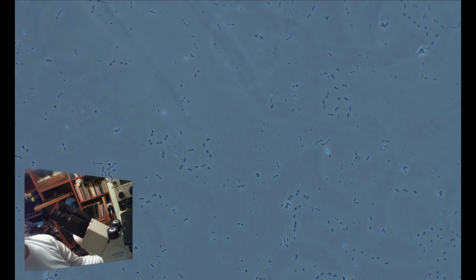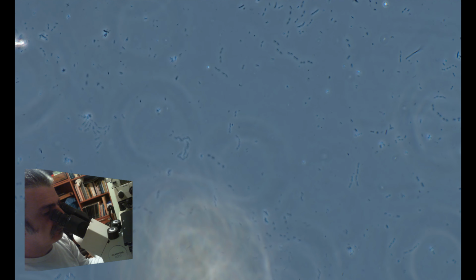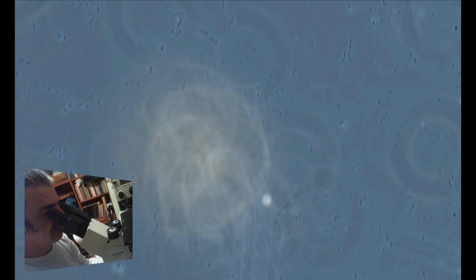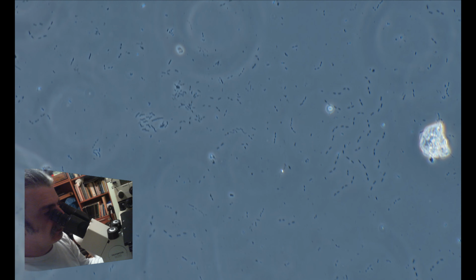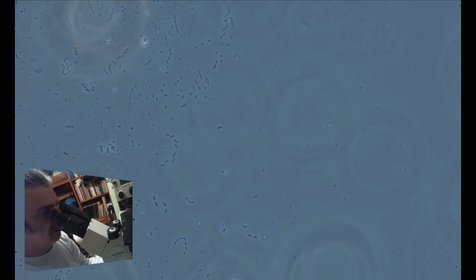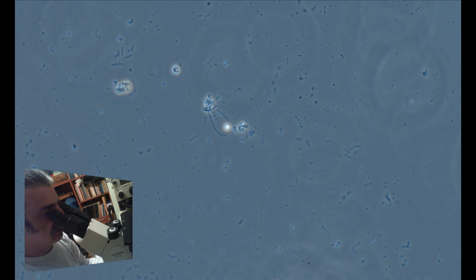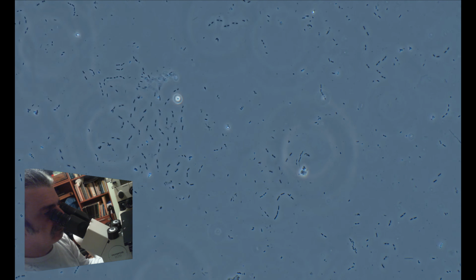And now what we are seeing, those spots, are bacteria. Bacteria that float on the top surface of the water. And we'll surely find some creatures that harbor them soon.